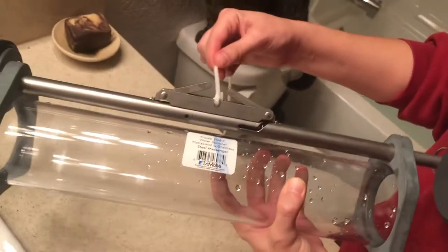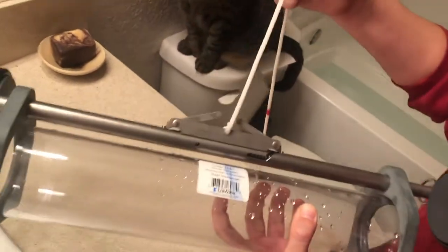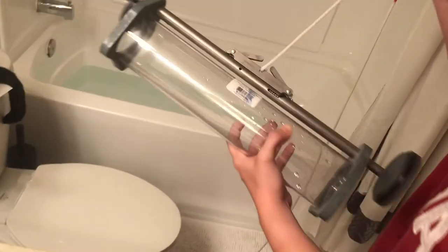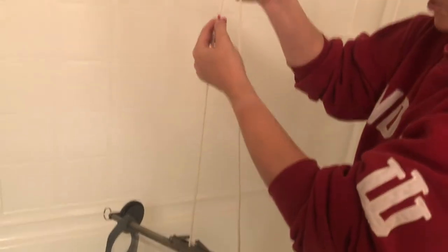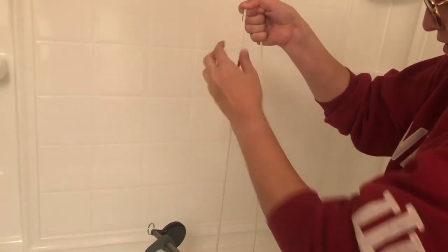Now both triggers are set. Next, we'll go to the bathtub. Each of these red lines measures one meter — not this part, but the next one — and they're 20 meters total. This is our messenger here.